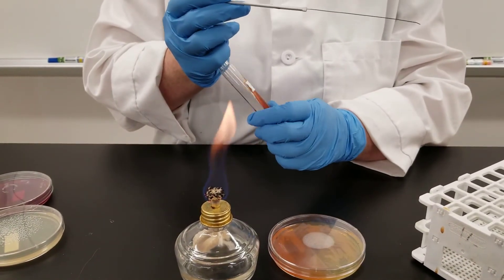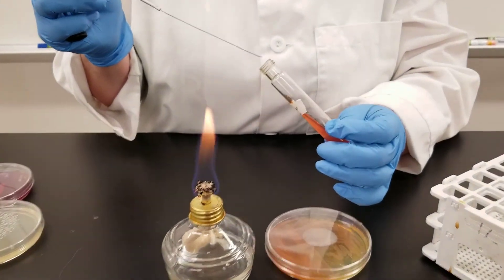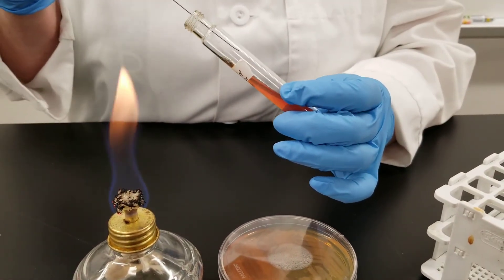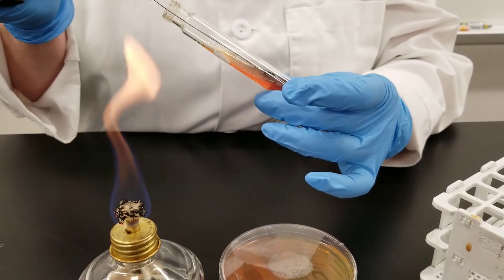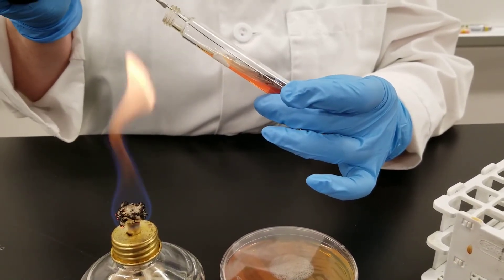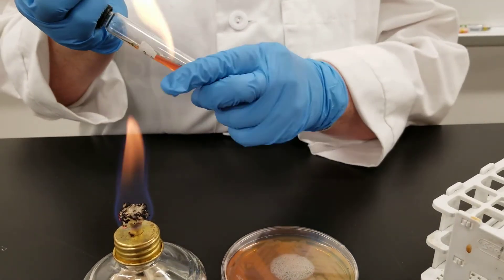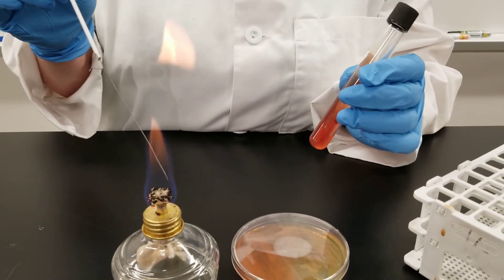Once again, flame our tube. You have already streaked along the slant. So hopefully you can see this. We are going to take the needle just straight in, down, back up. Flame the needle again.